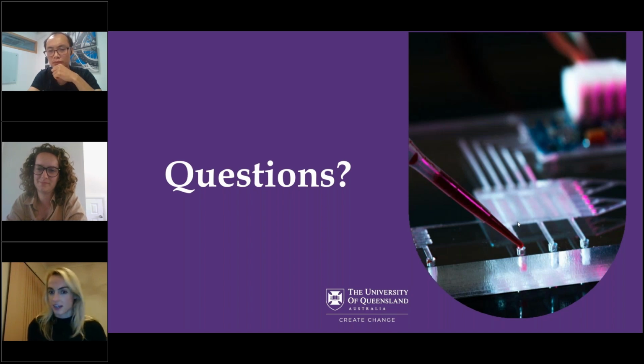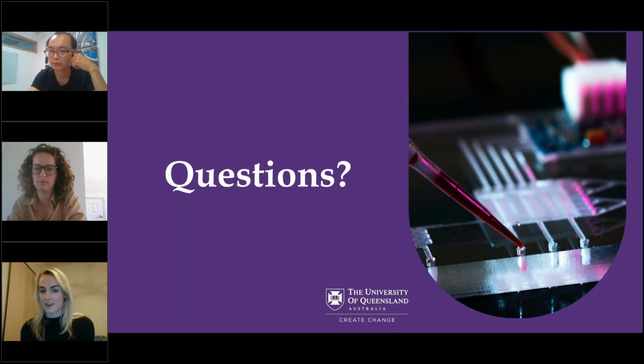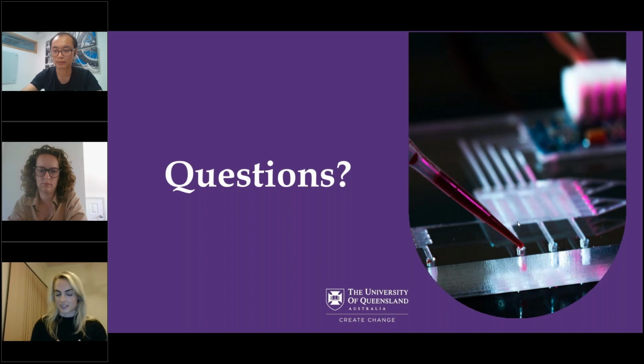Good question. I haven't measured the viscosity in liquid form of these. I've measured the viscosity in gel form, so I know a little bit about that. But viscosity is essentially your enemy when it comes to using systems like this. If your viscosity is too high, it's difficult for your pump to push through, and therefore you have more blockages and a slower encapsulation rate. There's a certain viscosity that you just can't get through this system. So that's why we use low melting point agar, because it has a lower viscosity. And when I use alginate, I use the low viscosity alginate in order to get it through the system at a faster rate. I wouldn't recommend using highly viscous polymeric solutions in this microencapsulator system at all. I would go as low as possible in order to set it and have a nice microparticle or microsphere.